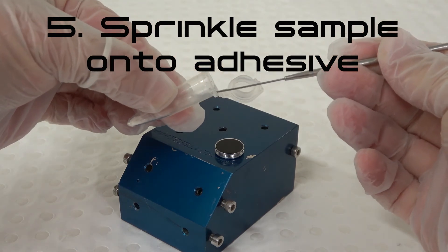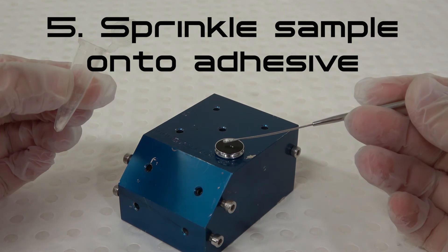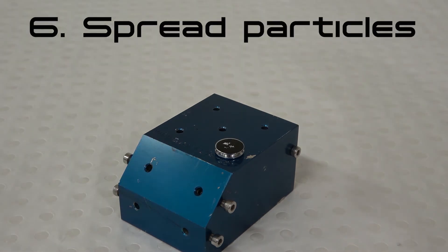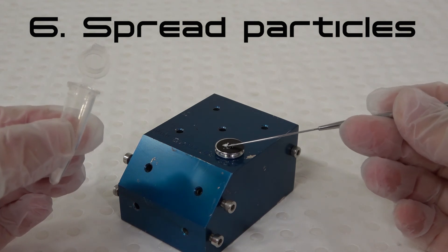Step 5. Using a clean small spatula, sprinkle a very small amount of the powdered sample onto the adhesive. Step 6. Gently spread the particles across the adhesive using the back of the spatula.